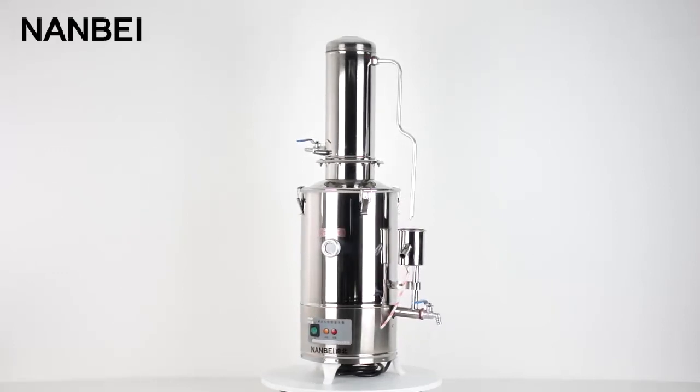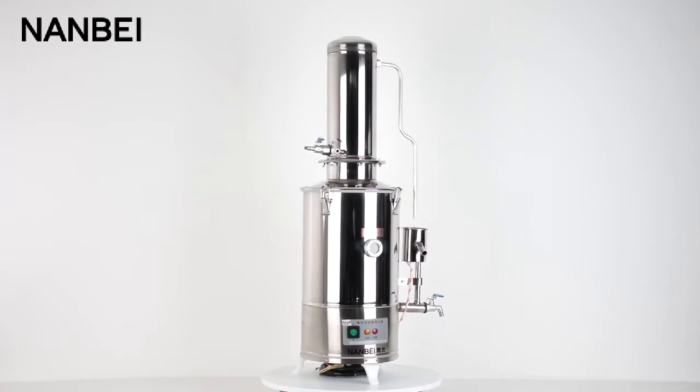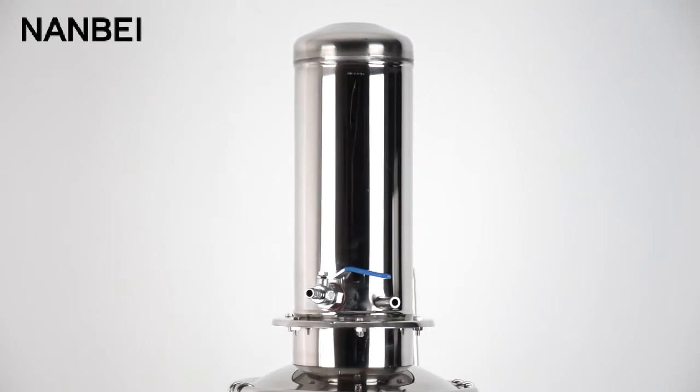High Quality Stainless Steel Water Distiller Machine. The condenser is made of seamless stainless steel pipes, with very good cooling effects and great capacity of water production.